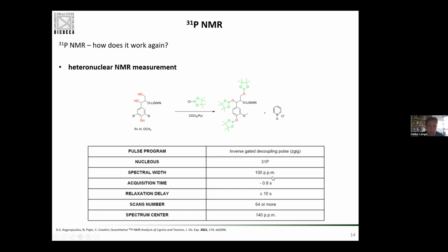If you don't have a certain type of standardization, and if you do not make sure that the quality of your spectra meet a certain level, then obviously we enter in a type of discussion where we do not talk on the same level. So that makes things very, very difficult. Therefore, I highly recommend that we stick all to one protocol. Now, it's maybe not my preferred protocol, but it's a protocol that everyone uses, so I keep comparability basically across the works, and that is, for making progress, very, very important, obviously.